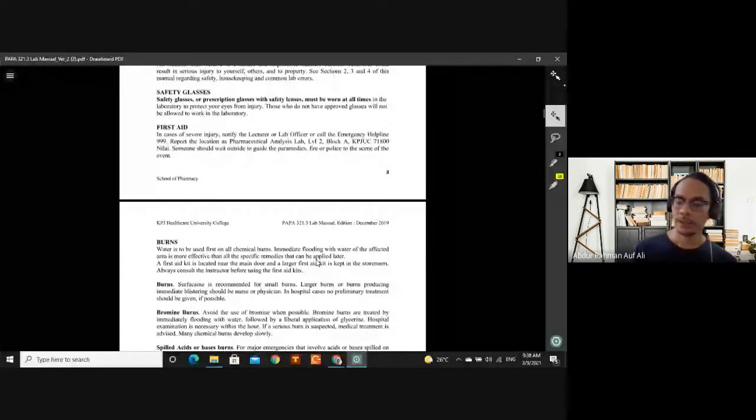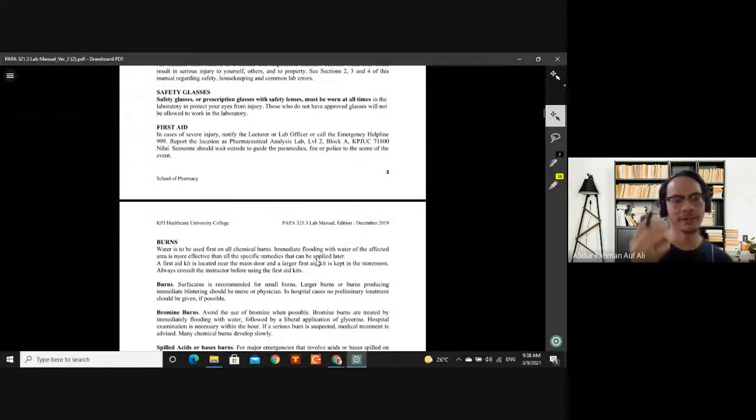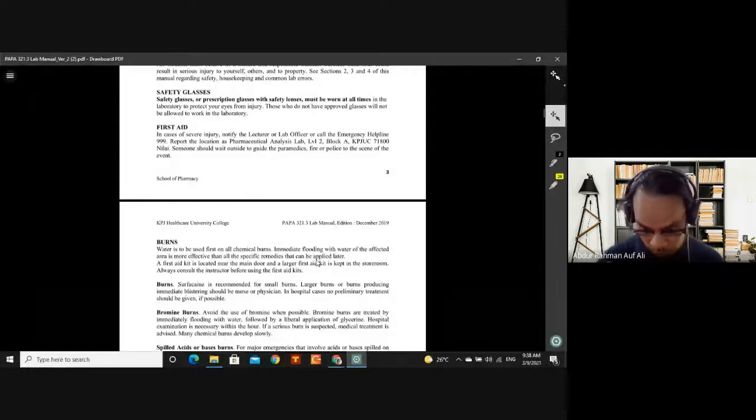If it gets in your eyes, there is a specific place. It's not a machine, it's a specialized place. It's like, what do you call that thing when we want to drink water? Sprinkler. Oh my god, I'm running a blank right now. There is a machine where you can just press a button and water will pop out. So you just put your eyes over the machine and water will run straight to your eyes.